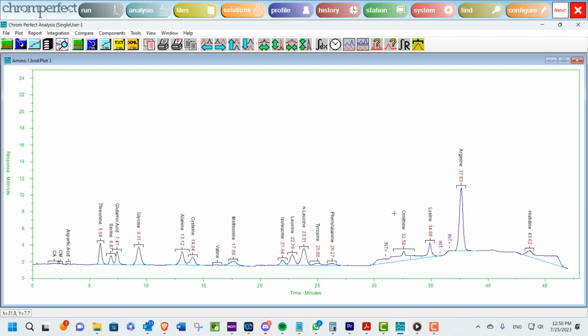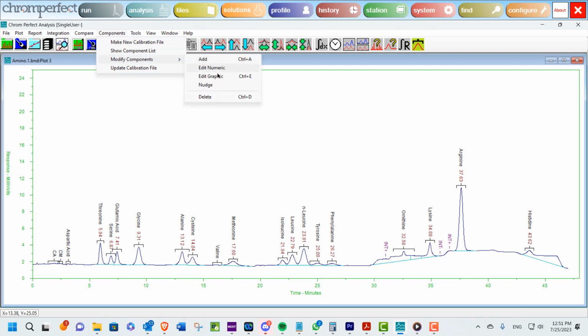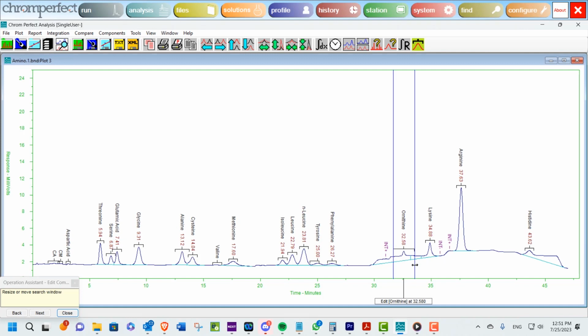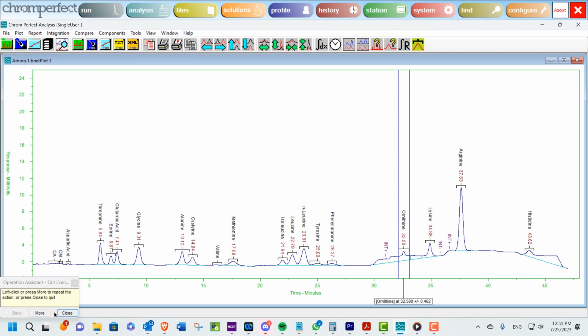Once a chromatogram has been bound, it no longer depends on the standalone method, calibration, and format files on disk, which are subject to changes. Furthermore, if the user alters the method or calibration settings before binding, then the bound file will reflect those changes. In this situation, the snapshots will not be exact copies of the standalone files, which are unchanged by such alterations.